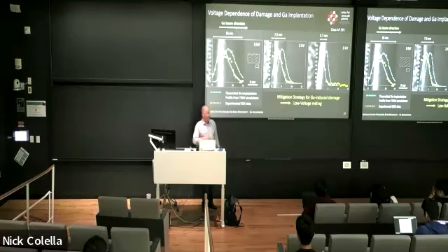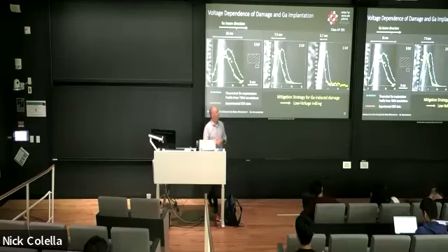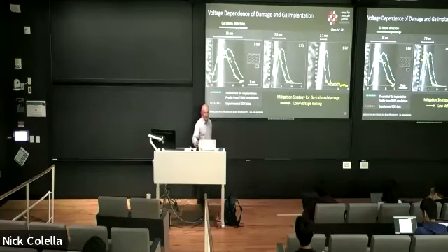So that is ultimately the strategy for how we are improving the quality of TEM samples. We typically operate the instrument at the highest energy, at 30 kiloelectron volts, which produces the sharpest beam and has also the highest sputter yield. But then when we prepare a sample, at the end, we go down with the energy and carefully shave off the damaged surface layer. But ultimately, even at 1 kilovolt, which is sort of the practical limit on the focused ion beam, we still have quite a bit of defects in the surface.